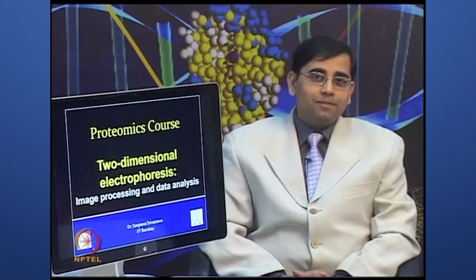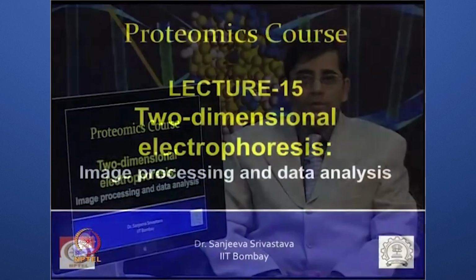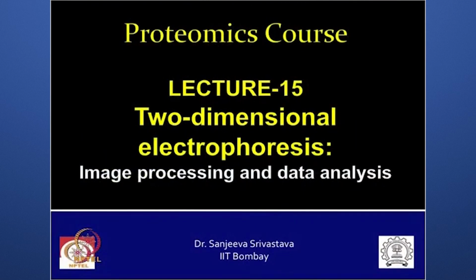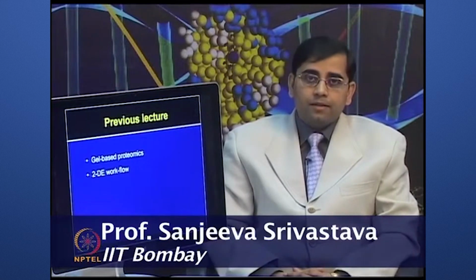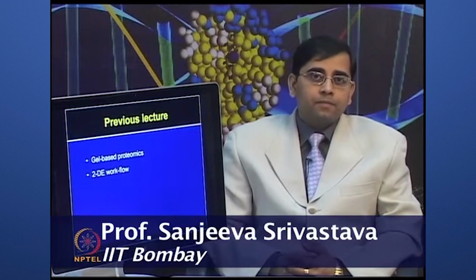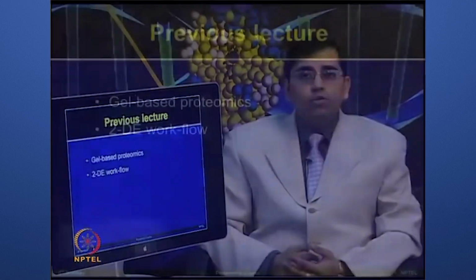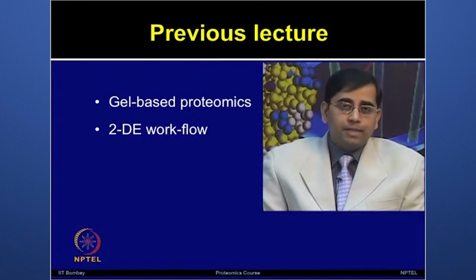Welcome to the Proteomics course. In today's lecture, we will talk about two-dimensional electrophoresis, image processing and data analysis. As in the last few lectures, we have discussed two-dimensional gel electrophoresis and various types of gel-based proteomic techniques such as SDS-PAGE and blue native PAGE. We have talked about new advancements like off-gel fractionation as well as two-dimensional gel electrophoresis.